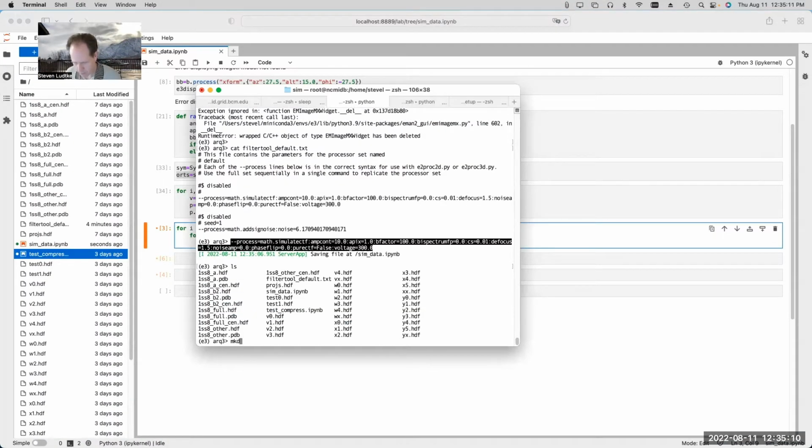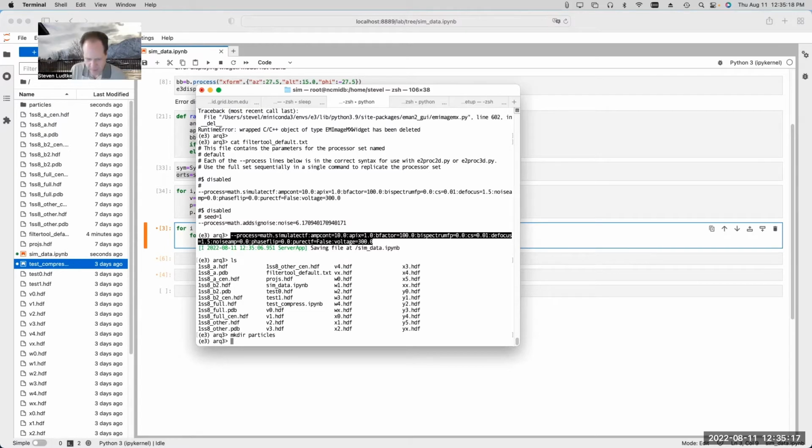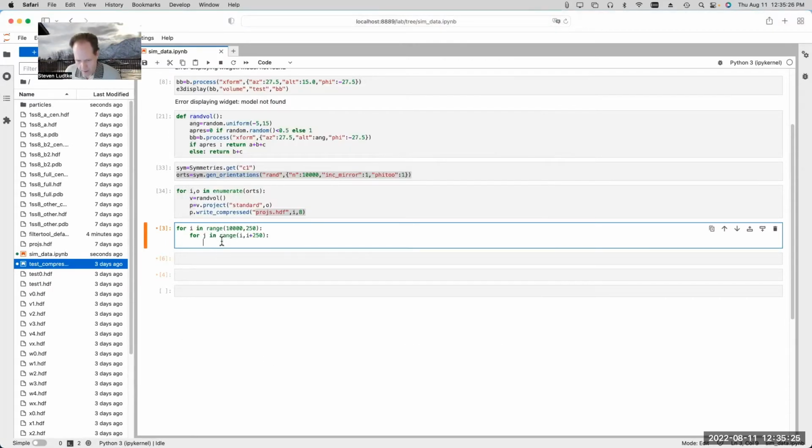So I'm going to make a folder called particles. I'll probably shift that folder into another subfolder so we can make like an EMAN2 project where I'll run the refinement and stuff. But for now, we'll just call it particles. Now we'll say image is EMData proj.hdf.